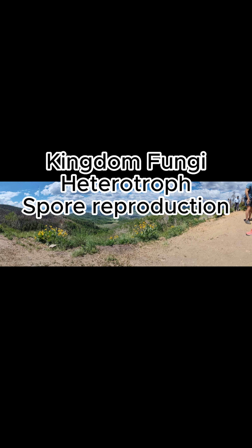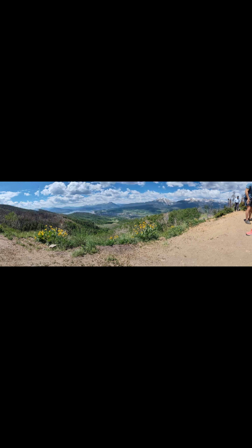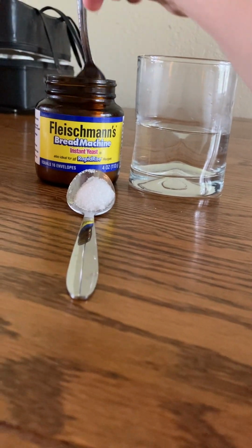If you have access to mushrooms, it would be really helpful to observe them as part of this topic, but where I live, it's not really the right time of year to find good mushroom specimens. So, some common household substances that also fall into this category, like yeast and mold, are going to be the ones that we look at today. I'm going to show you what these specimens look like under a microscope. Let's do the yeast first.